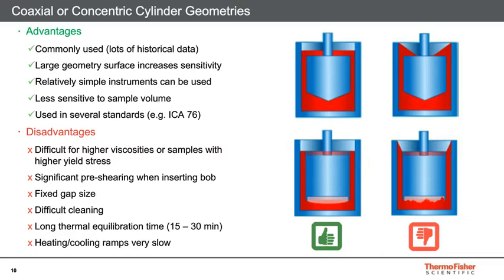They can be very challenging to clean, so if you have a very sticky, thick sample, it's hard to actually get into this cup sometimes and clean it fully. And because you're using higher sample volumes, it takes a long time for the sample to reach thermal equilibrium, sometimes 15, 20, even 30 minutes to get up to the test temperature.